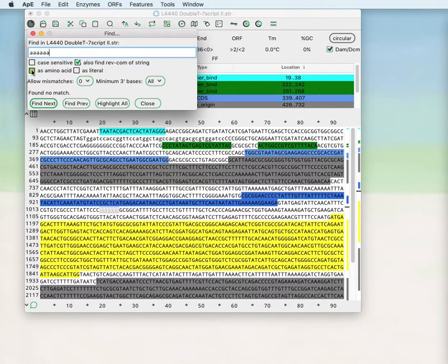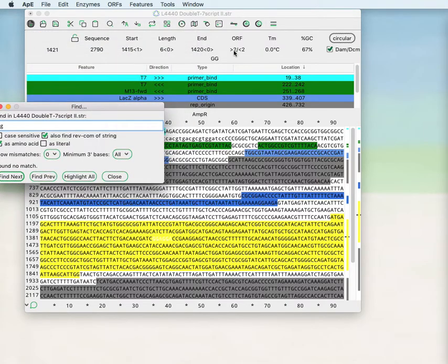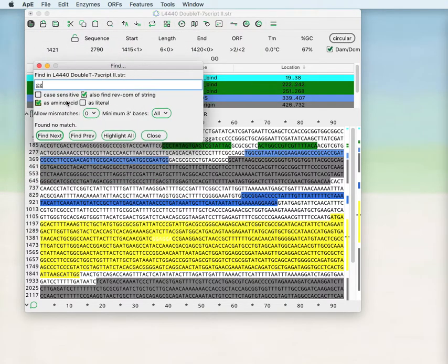You can also find it as an amino acid, so if you search for gg it will find it as the translated version of that sequence.